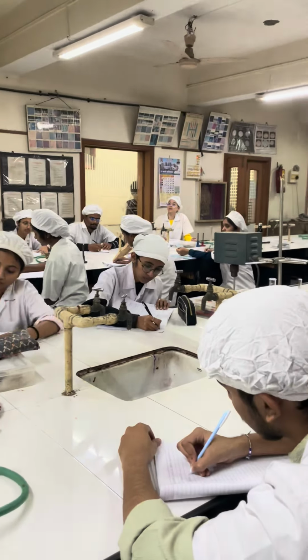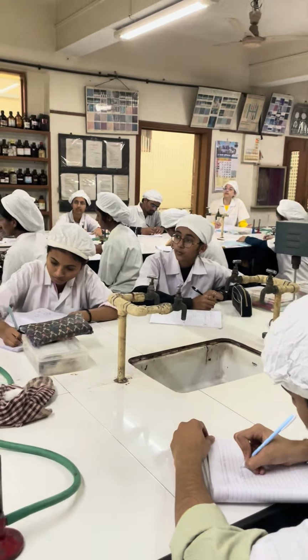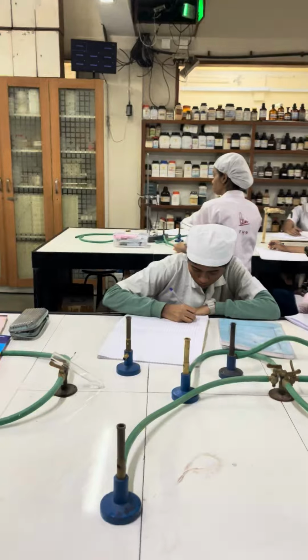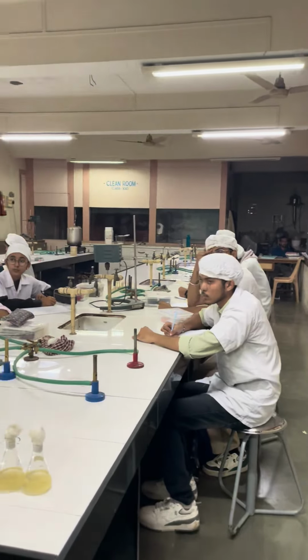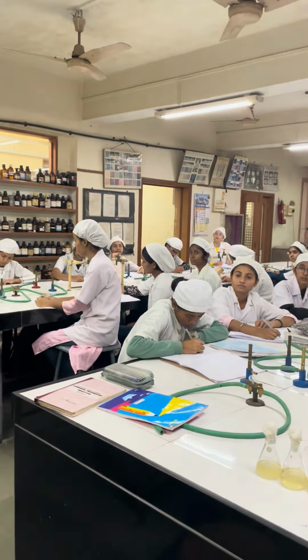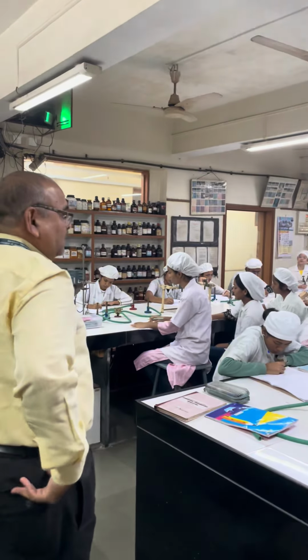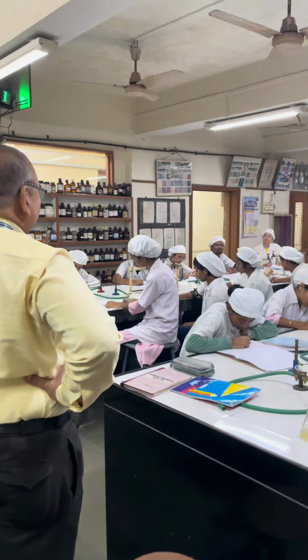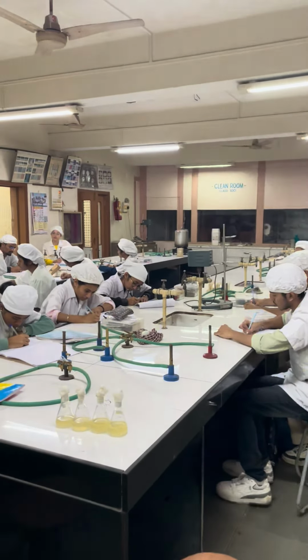Now what is the objective of this practical? If you learn this practical, you will be able to find out whether the water is potable or non-potable. And to find out whether the water is potable or non-potable, coliform bacteria are used as indicators. Coliform bacteria are those bacteria which are seen in the colon of human beings and animals. They are used as indicators for water pollution.